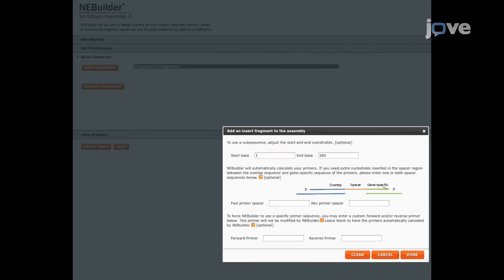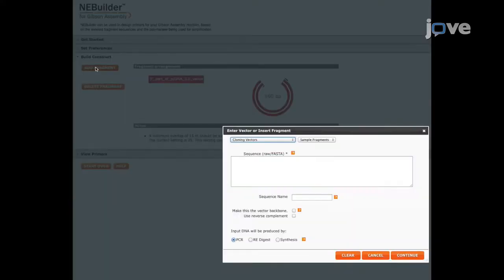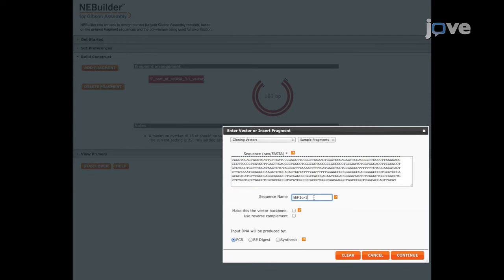If there is a need to add extra nucleotides or restriction sites at the junction of the final construct, then open the Add and Insert Fragment to the Assembly window. In the Forward or Reverse Primer Spacer areas, enter the extra nucleotides or restriction sites to only one of the DNA fragments. Then, click on the Done tab. Repeat for all of the fragments until the construct is complete.